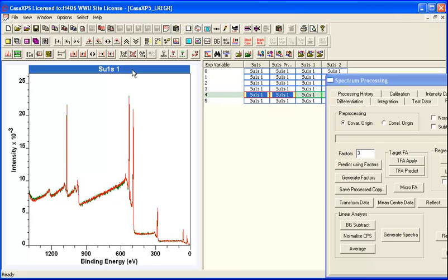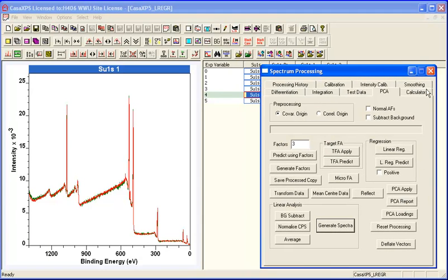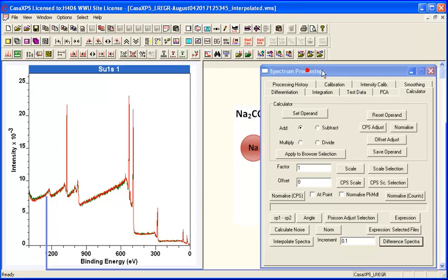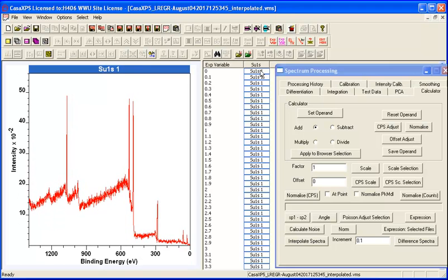That these here seem to be very close, so let's calculate now a difference sequence based on the raw and the least squares solution. And the idea is that I need at least one more basis function in order to remove that difference that I observed in the least squares solution, where I used two basis functions.